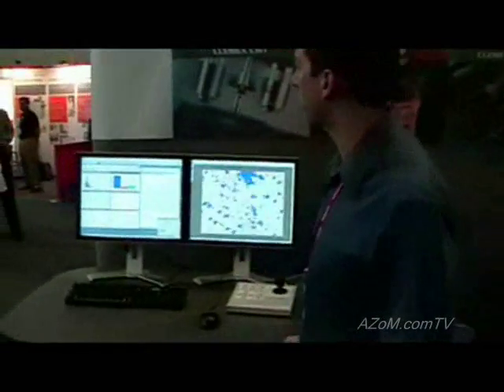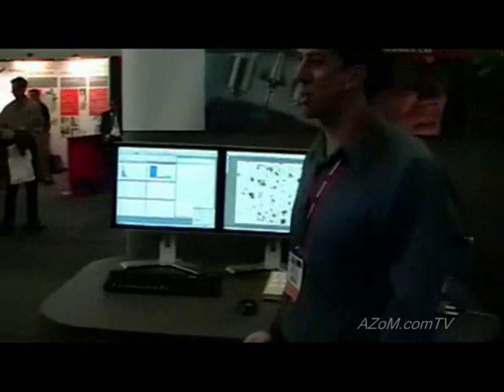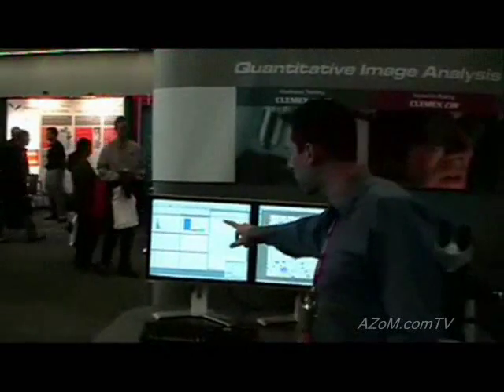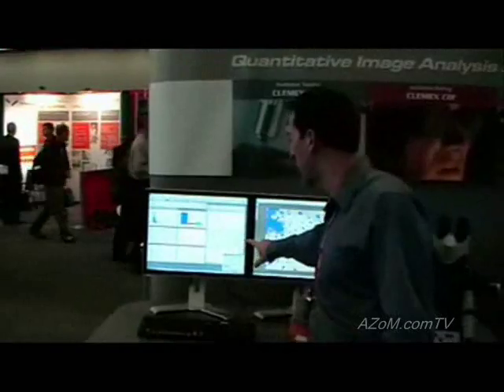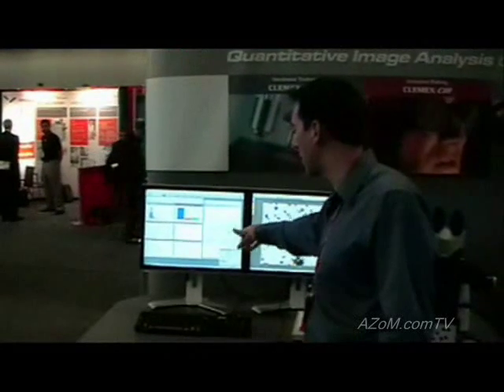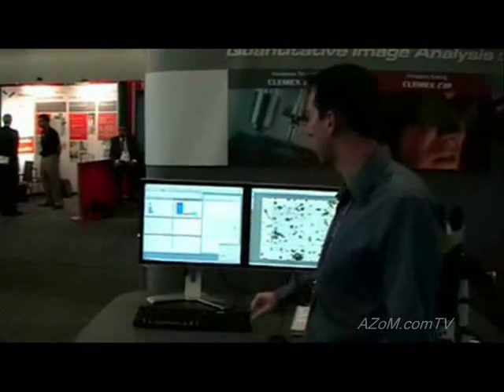On the screen over here, our software is able to control all aspects of the hardware. In this section of the screen over here, you can see the movement of the stage as it goes around.